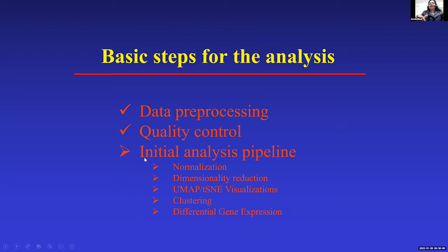And now let's start with the initial analysis. So we have done pre-processing. We have the matrix file. We have done quality check. We removed the doublets, multiplets, and all. Now we go for the initial analysis.